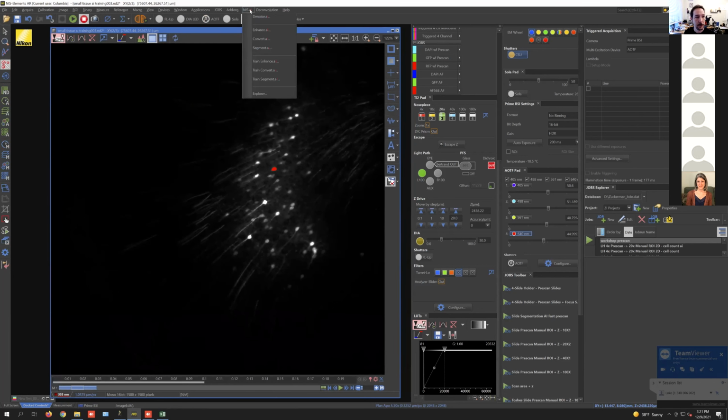But for every fluorophore and every combination of different labeling you use, it's going to have different background. You'd have to redo this, right? It's not necessarily that if you have cells of this kind, it would always work? Yeah, I think you obviously would want to check this, but if you had another neuron population with a similar expression pattern, like here where we have it in the cell body and the axons and dendrites, it doesn't matter what color it's expressing, this network will work well.